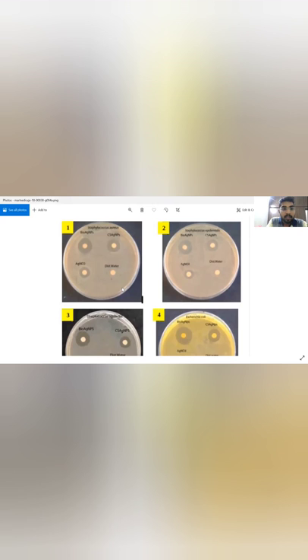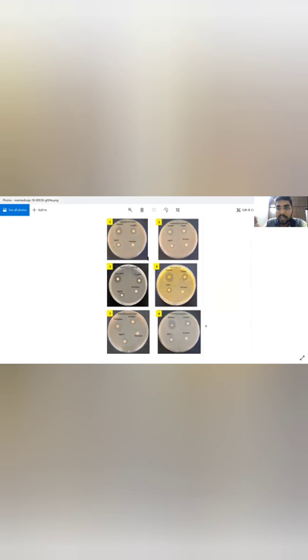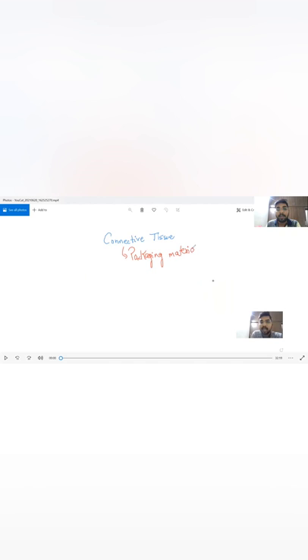Here is another example from Google Images showing silver nanoparticles tested against Staphylococcus aureus, silver nitrate, and distilled water as controls on E. coli. You can see larger clearing zones around E. coli for certain treatments. These are disc method results - you can see the discs placed on the plates. From this we can conclude which plant extract shows the highest antimicrobial activity.